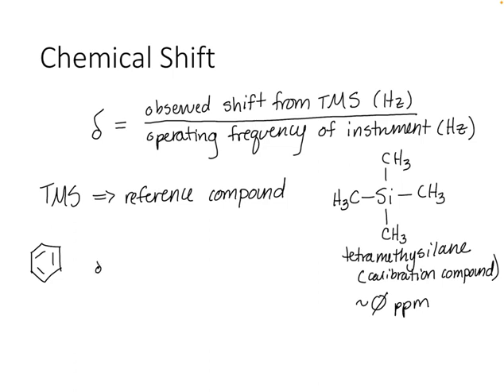So what we would do is we would use that fact and we would divide that by the operating frequency of the instrument, which I said was 300 megahertz.